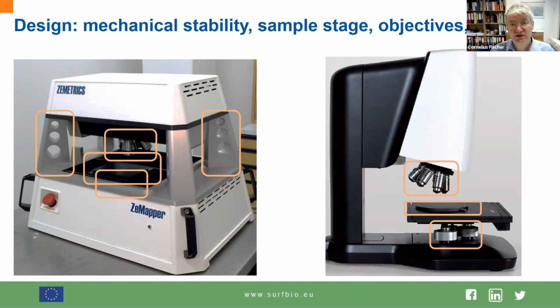There's another important point, that's the tip-tilt correction. So the orientation of the sample stage, and much more important, the orientation of the sample surface under investigation is a very important point. Quite often overlooked, and then people are measuring something, then later on, oh, I need to correct for the orientation of my sample, and I will do that via software analysis, via software treatment. What is a pretty bad idea, because this is not a tomographic system.